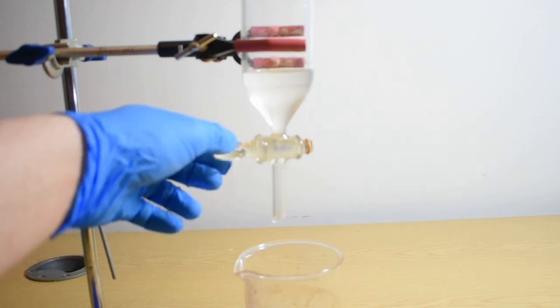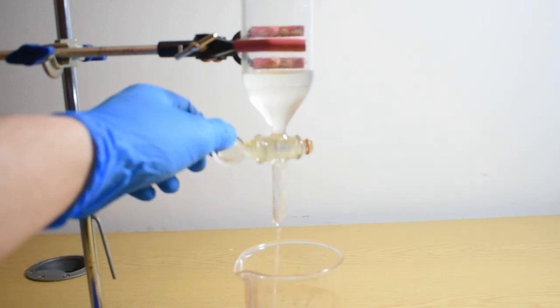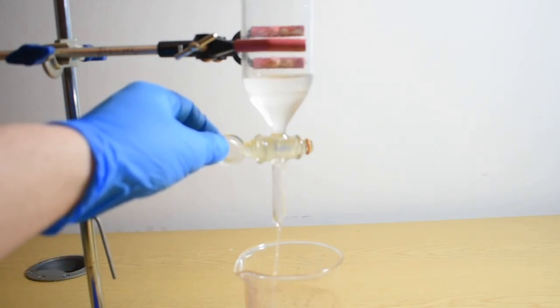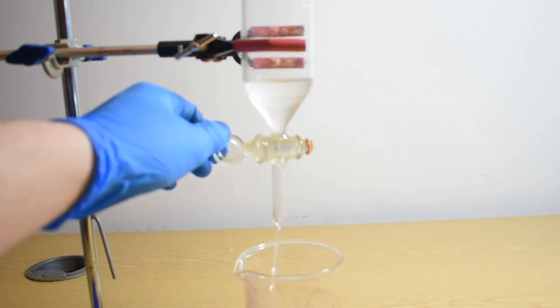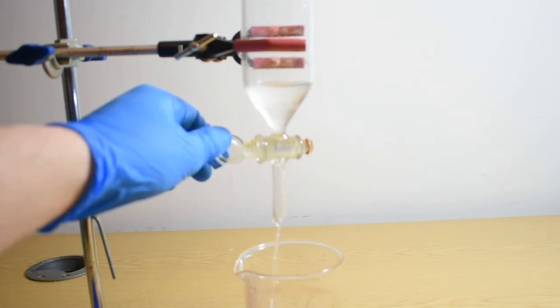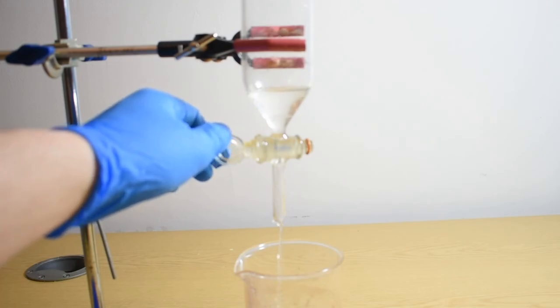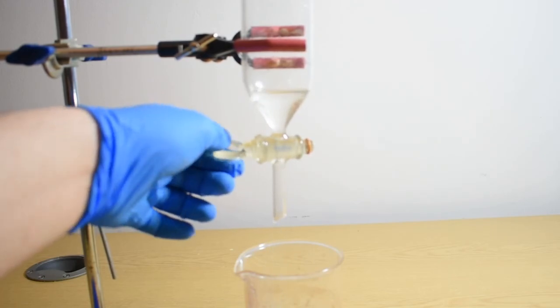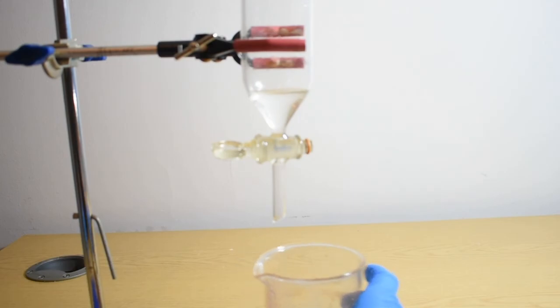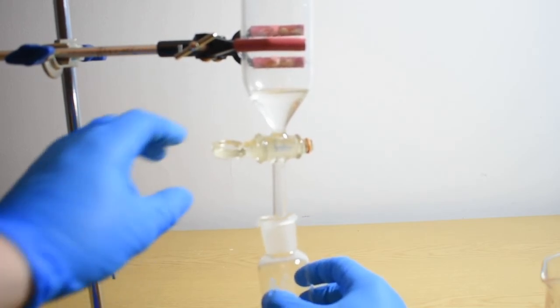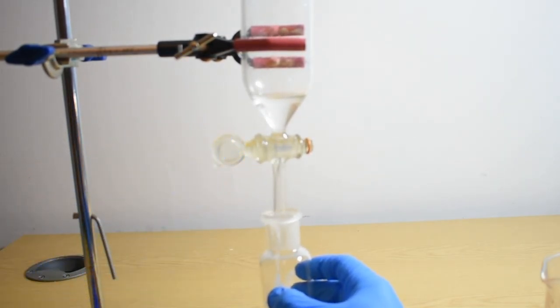Once the lower aqueous layer is drained what should remain in the separatory funnel is quite pure ethyl acetate. The washing steps are discarded and the product is emptied into a 60 milliliter bottle.